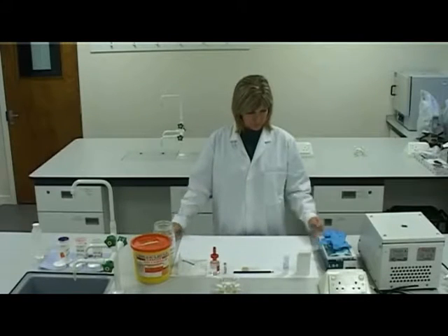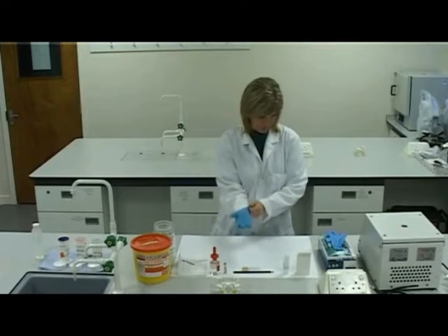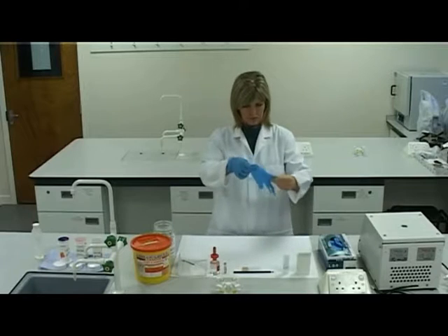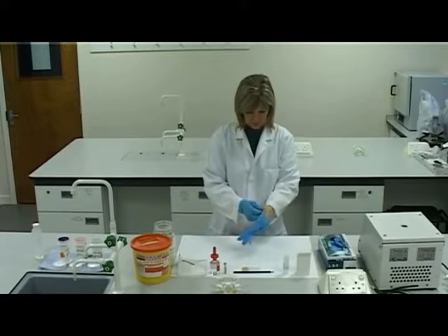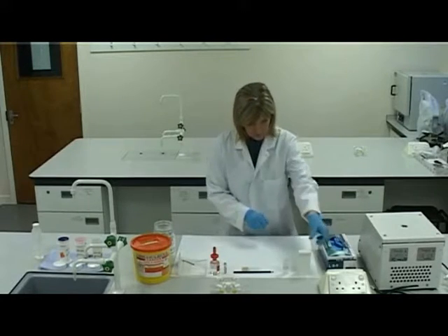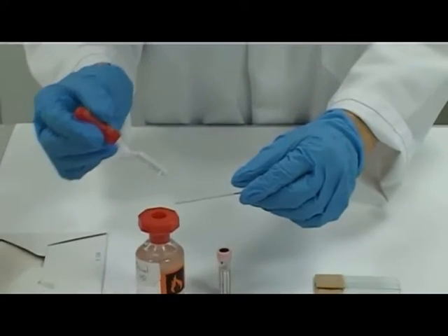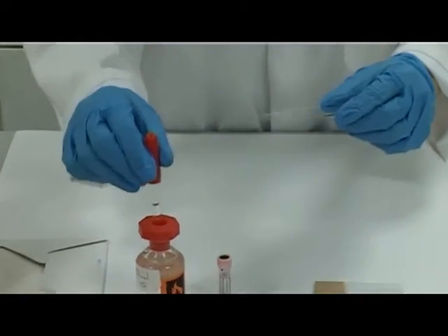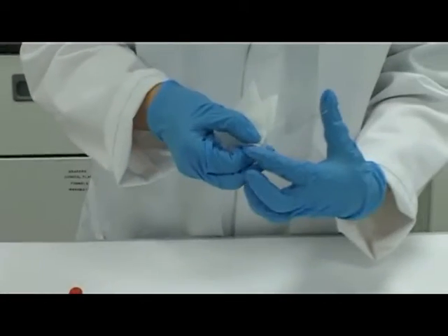Put on gloves. Select a microscope slide. Clean the slide using ethanol or absolute alcohol and dry the slide with a lint-free tissue.